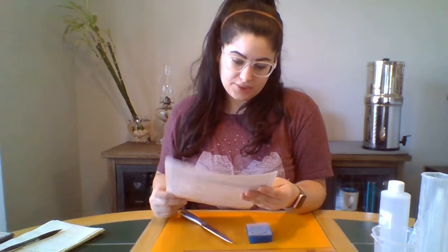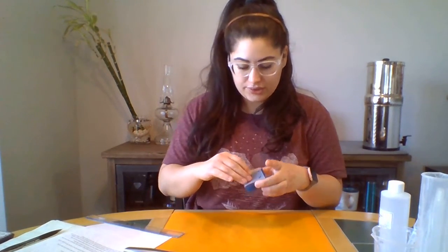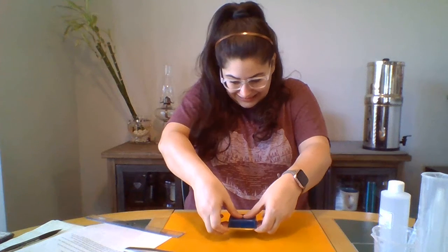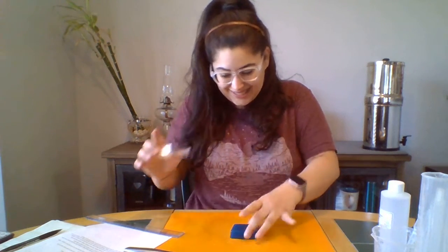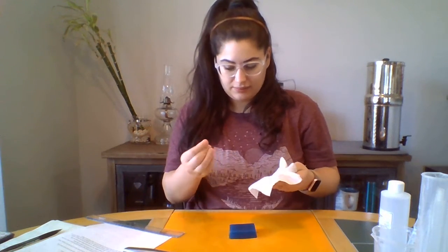So let's see, the first thing that we have to cut is a 1 centimeter by 1 centimeter by 6 centimeter block. Okay, so I'm going to use my ruler to measure that out. Well, I guess I have to pop it out first. Such a fun texture. Like a very tough jello. Interesting. Oh, this is it. It didn't lay completely flat on this side. You can kind of see the light hits it, a little bit raised, but that's okay. I will do my best.